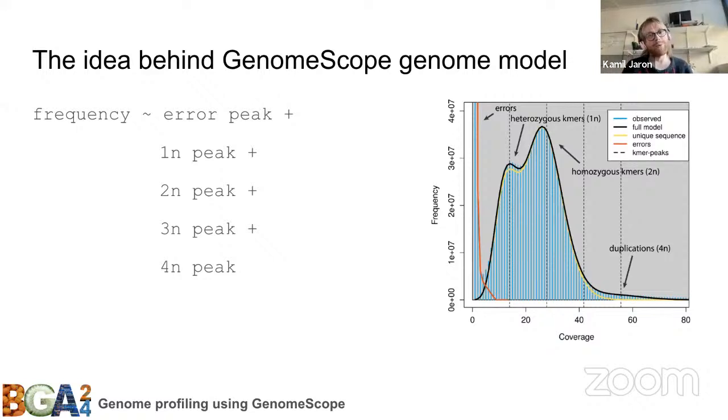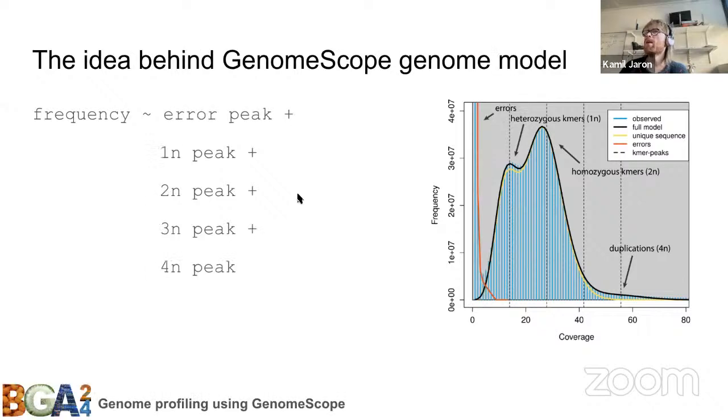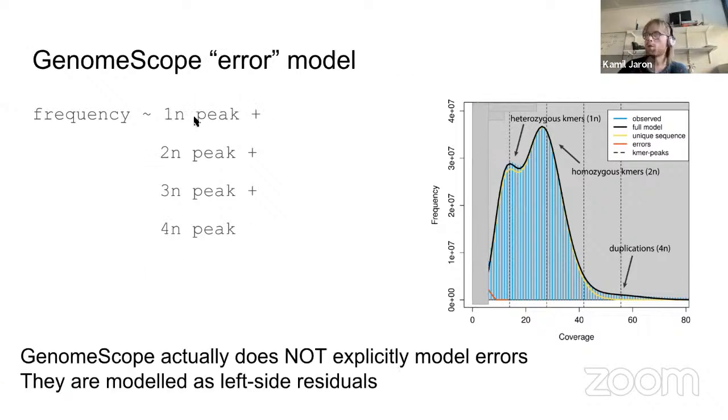So we will need to take one step back and re-evaluate what it actually is we're fitting. We would like to fit something for the errors. We would like to fit a bunch of negative binomials for all those peaks that are in there. So if we simplify our life for a bit, let's ignore all the multiplicity cases and just fit 2 peaks. Let's ignore the errors, because we can just say, ignore everything that is lower than a certain coverage, and we can manually select that.